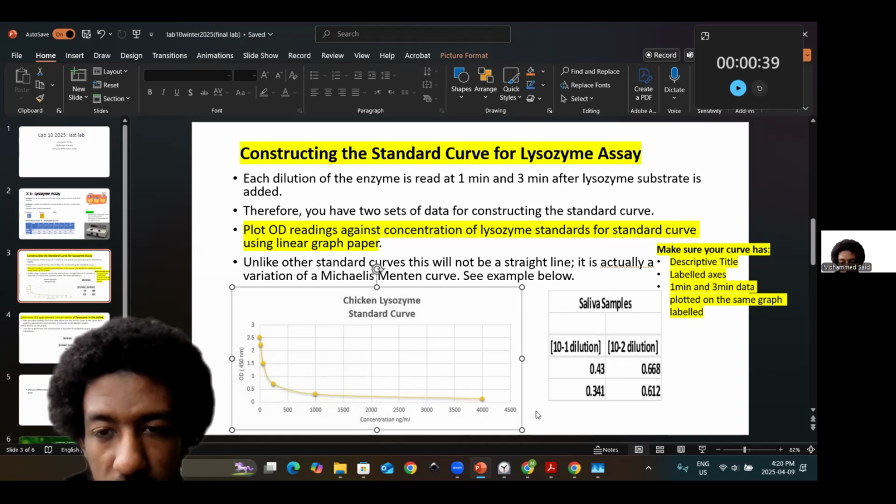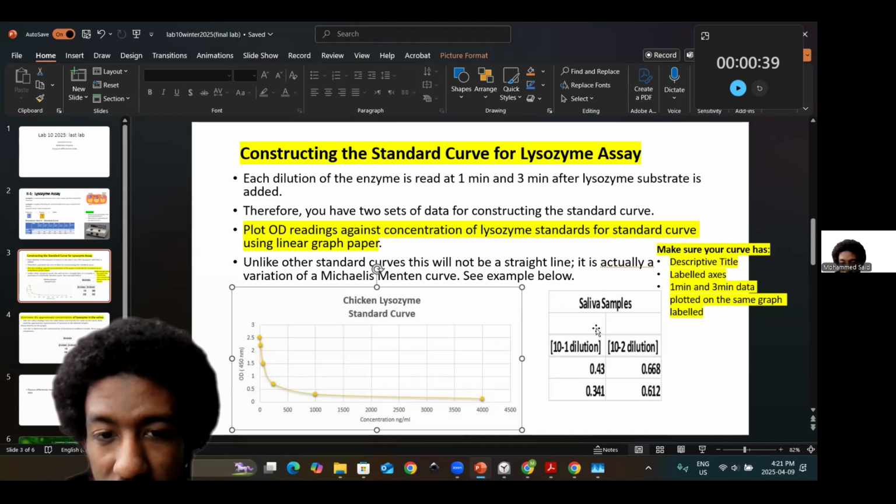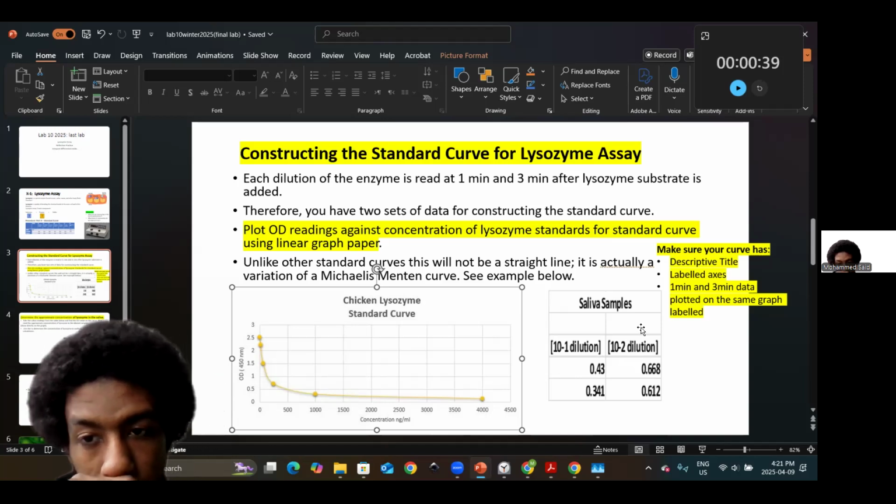And so essentially that's what you would get. For patient 1 and then patient 2, you would get the mean for both, because technically it's like viable counts, in the sense that you have two sets of dilutions. Let's say this was 3 micrograms per milliliter, and this was 4 micrograms per milliliter.